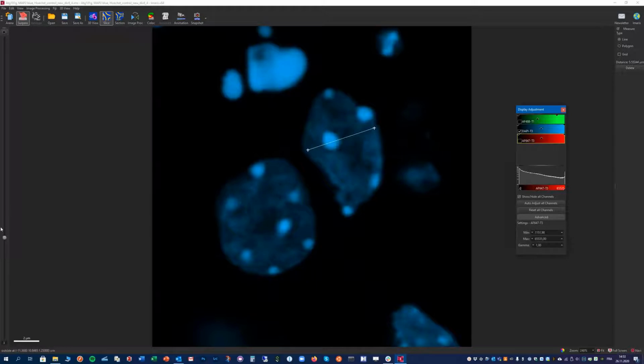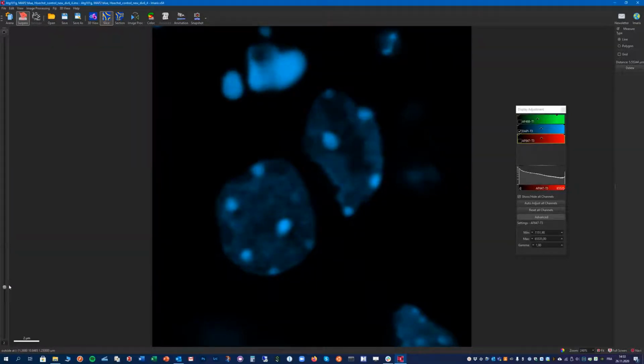As you can see, we can click 2 points into the image and we will have a readout here of the distance. This diameter corresponds to around 8 microns, but usually for a good detection I prefer to look for the smallest diameter, so around 5 microns here.